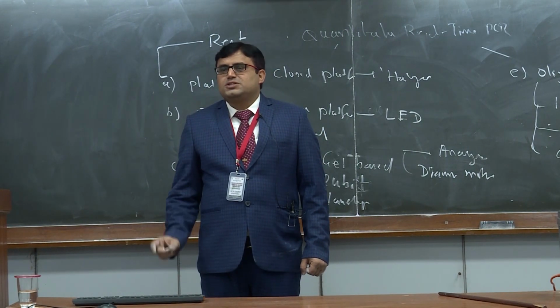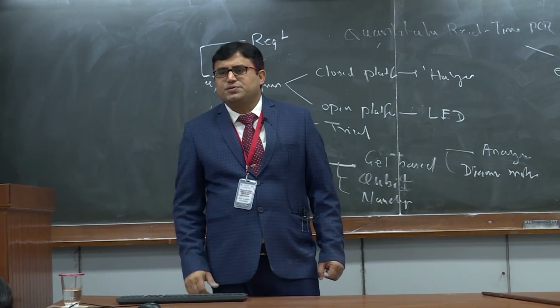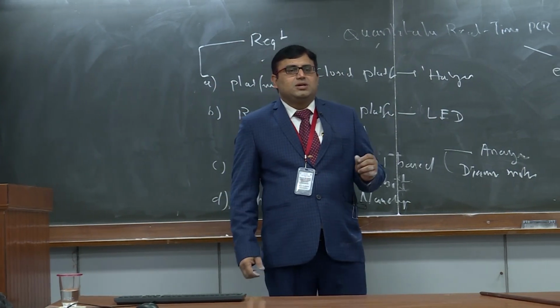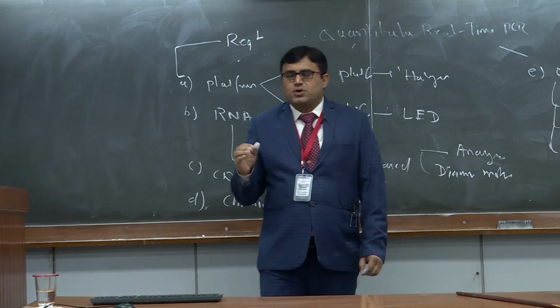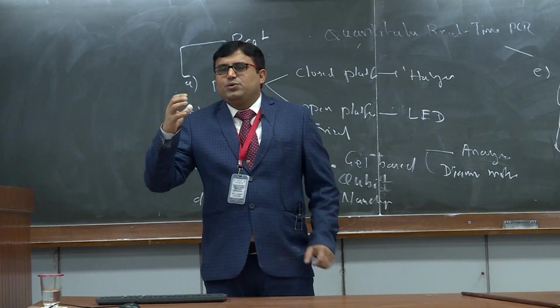Is it clear? This is one common mistake I have seen in most of the cases where people are using primers for expression. One primer will be somewhere in the 3' UTR region, the other will be within the gene. That is not the correct depiction of the expression of that particular gene, right? So these are some of the softwares. When you feed in your sequence, you can easily design primers.